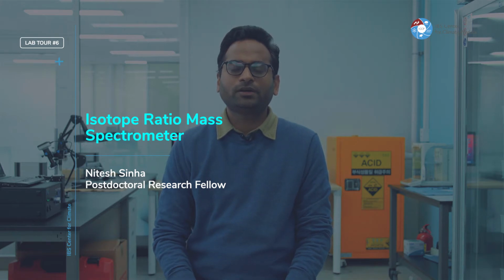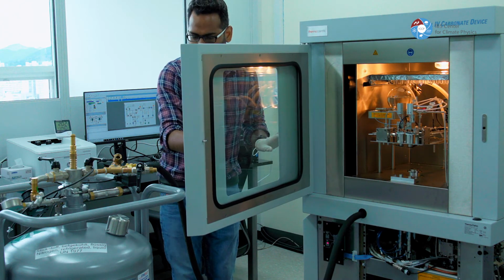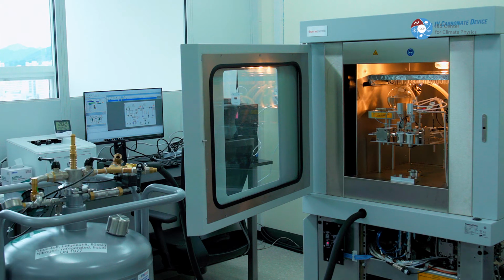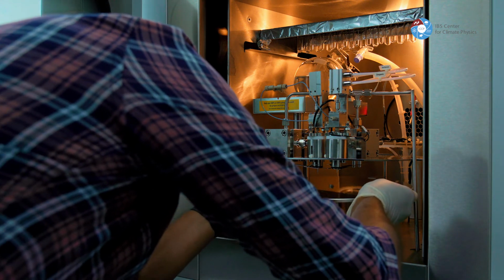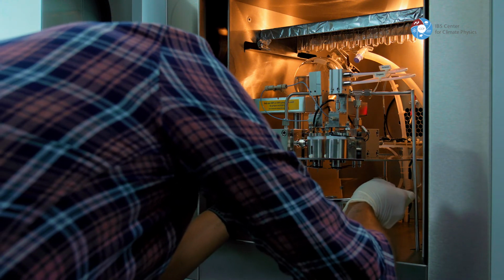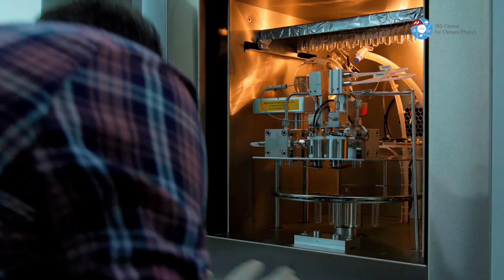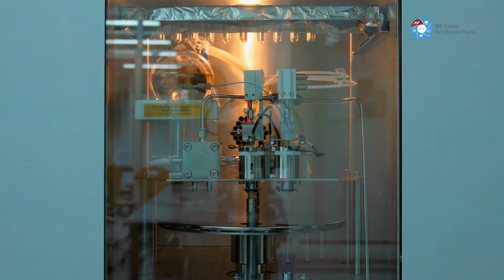We have a MAT 253 Plus and a Kiel device from Thermo Fisher. In the Kiel device, the calcite samples are transformed by acid digestion and cleaning processes into pure CO2 gas. In this process, the isotopic composition of the calcite powder is transferred over to the CO2 gas, and the clean CO2 gas is then injected, connected through a capillary, for isotopic measurement into the MAT 253 Plus. It measures, among many other things, carbon-13, carbon-12, and oxygen-18, oxygen-17, and oxygen-16 in ionized CO2 gas.